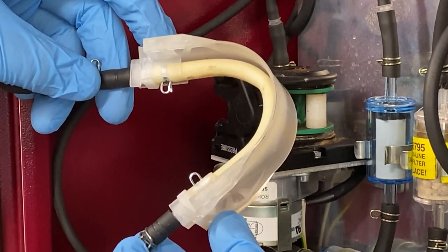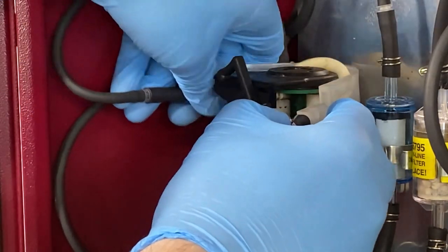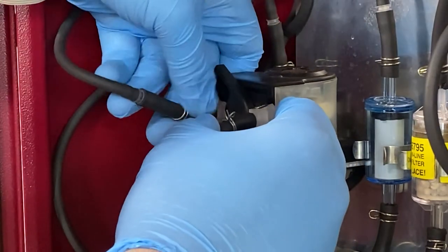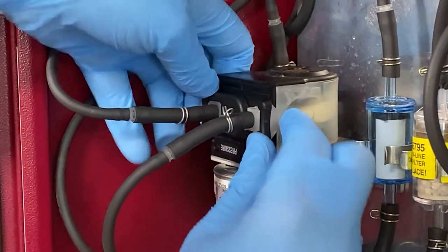Lastly, wrap the new condensate pump tube and the plastic covering around the condensate pump and close the N-shaped clip.